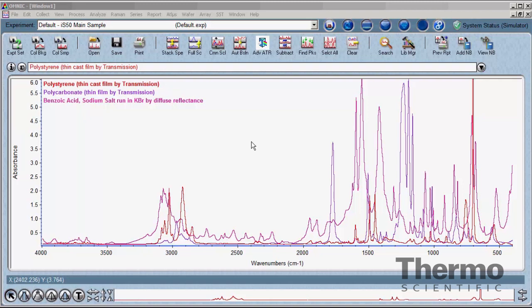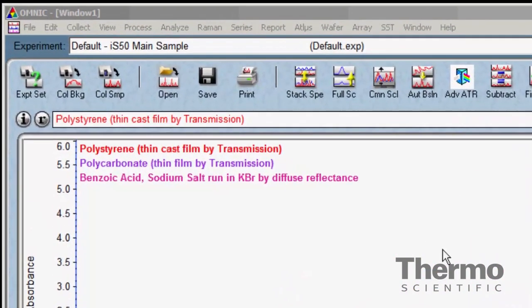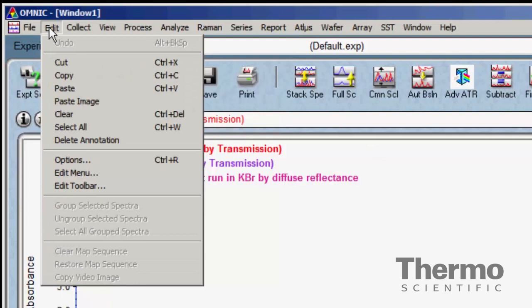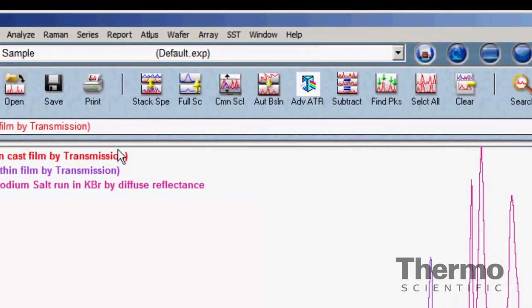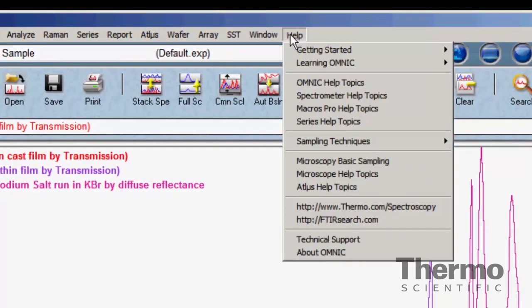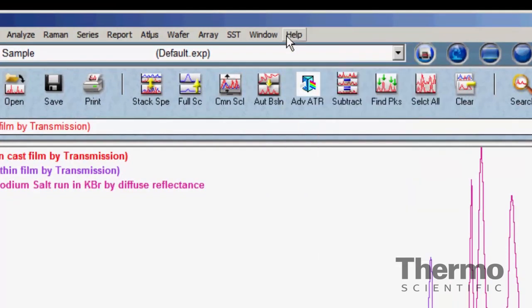Looking at the main display in OMNIC, at the top are various menus, similar to those in other software programs. The first two menus in the upper left corner, the File and Edit menus, contain similar commands found in most software. At the opposite end, the Window and Help menus also have similar commands to those found in other programs. The menus unique to OMNIC fall in between.